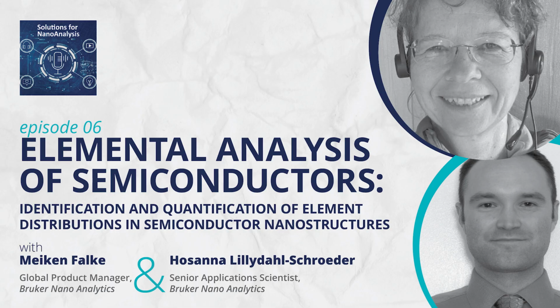And it has been shown also to be working in cryo samples, frozen in vitreous ice, for instance. Also forensics comes to mind, art and conservation, old stuff, what does it contain? So anywhere where many elements need to be identified, and all these topics might be used for next podcasts maybe.